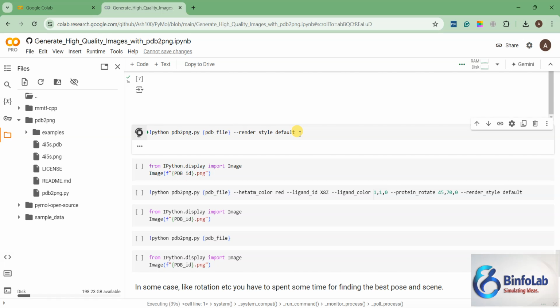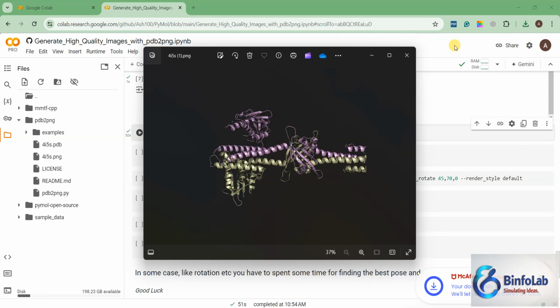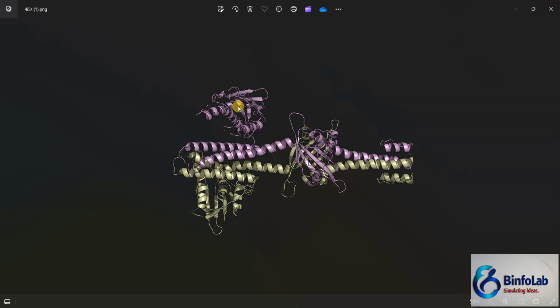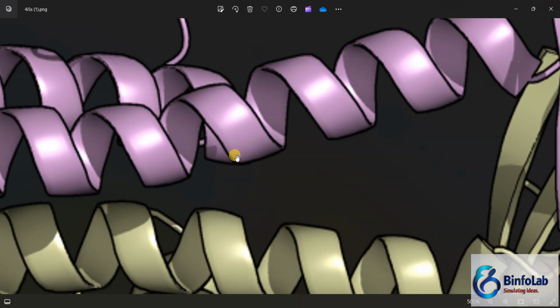So we will wait. Okay, done. Now click here, refresh, because this picture will be changed to a new one. Yes, here it is. So you can see it's sufficiently high quality.